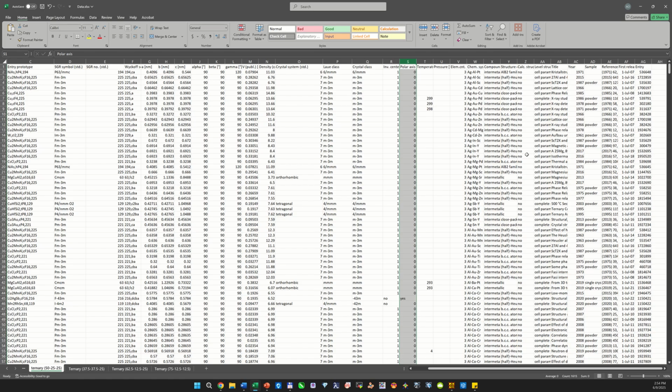I've never found the temperature and pressure to be very accurate or helpful columns for a simple reason, because we never know if it is the temperature or pressure at the synthesis or for the data collection. Even more, some crystallographic reports by default put room temperature as the data collection temperature, or even if it was reported at a different temperature, it is never mentioned there. And the default information from typical diffractometers is room temperature.